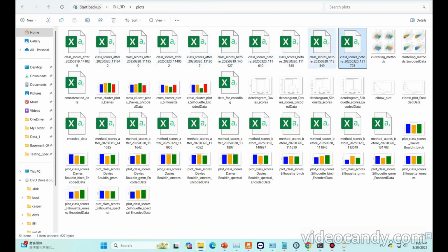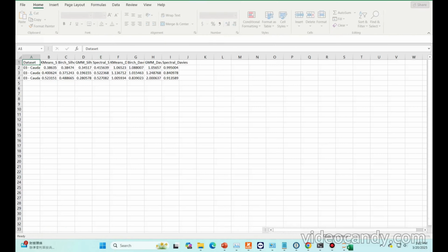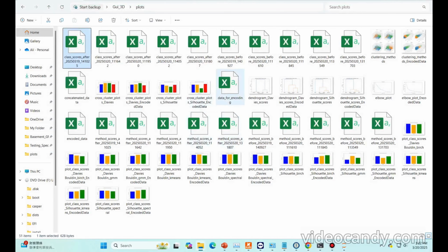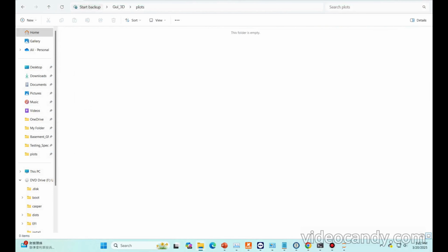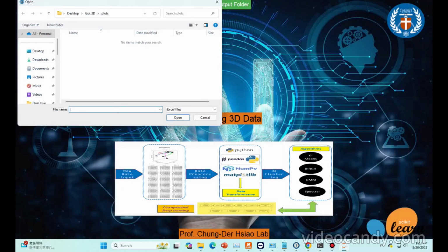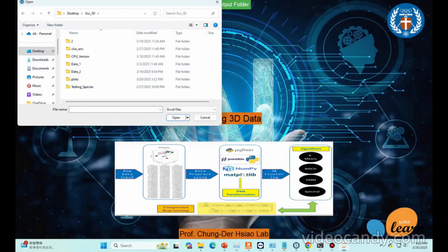Another important thing is that it is much faster than analyzing data manually. And the other important feature is you do not need to do any kind of pre-processing for the customization or for the locomotion behavior analysis related to neurodegenerative diseases as well. Zebrafish is well recognized as a neurodegenerative disease model for animal modeling in clinical studies.